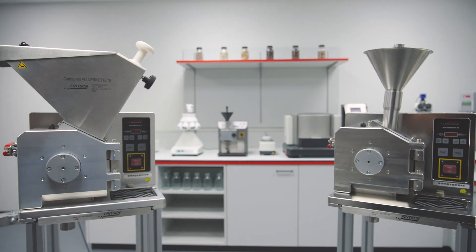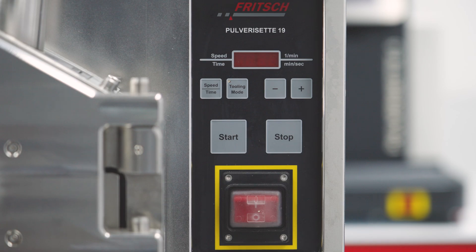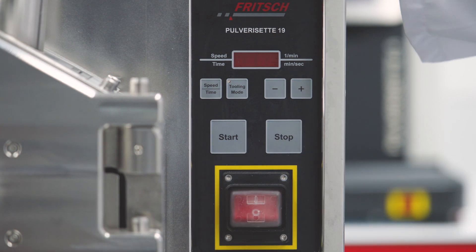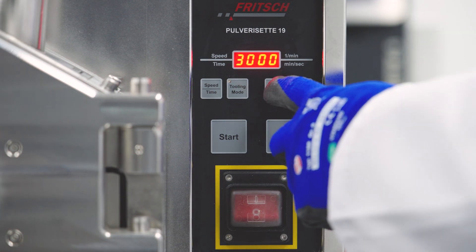Our P19 cutting mills are powerful all-rounders for the comminution of a wide variety of materials, from soft to tough, fibrous to brittle.